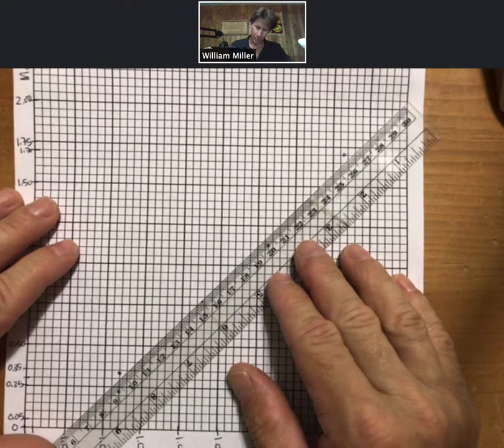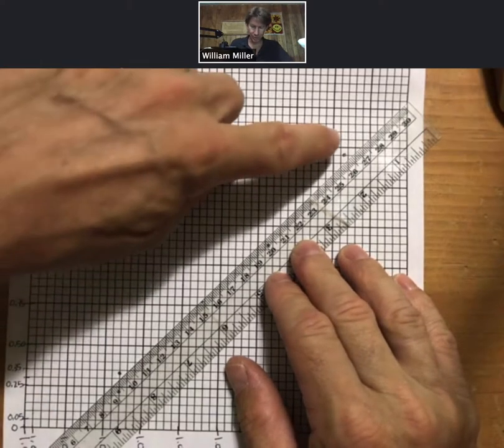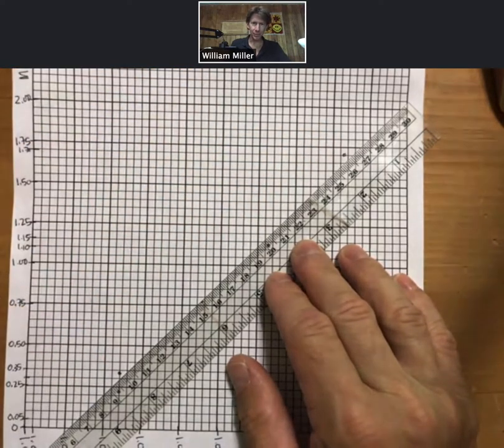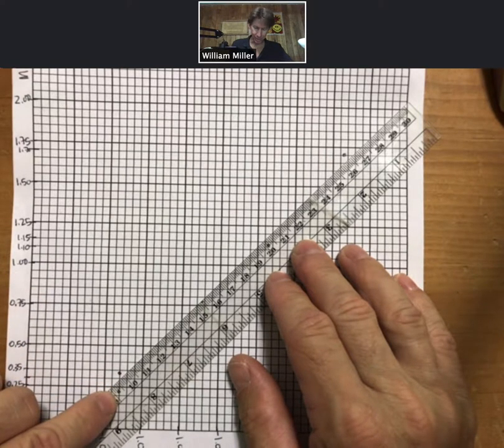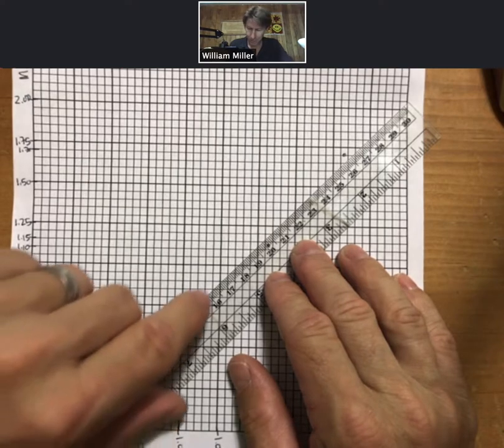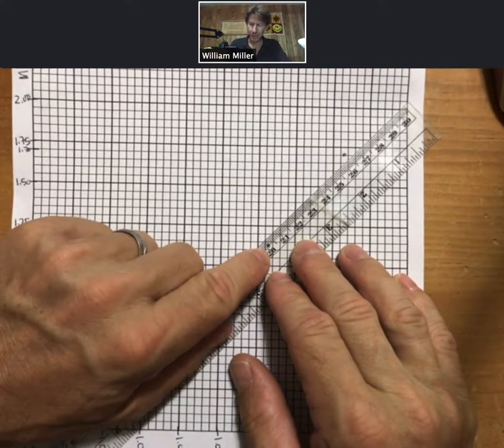What I've got here is I've got four points, and the positions of the points, I've got two of them above the line, or the best, what I'm going to call the best fit line, and two of them, you can see one under the ruler here and one under the ruler there, below the line.